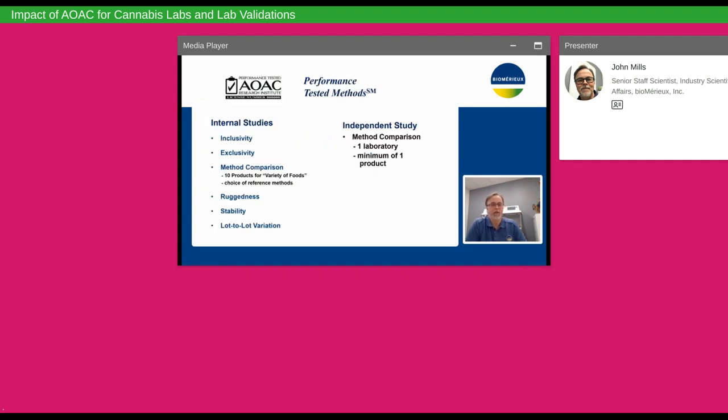More information on the performance tested methods. We talked about each of these just a little bit before. Inclusivity, exclusivity is required. Method comparison. You need to test at least 10 products for a variety of foods. Since we're talking about cannabis, I wonder if we may discuss with AOAC about changing that to a different term. Right now, that is what they would call a variety of foods for your performance claim. And then you need to determine the correct reference method.